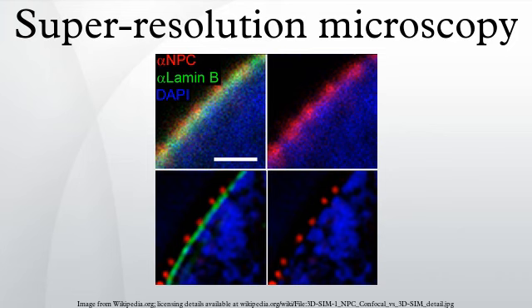SPDM is a localization microscopy that achieves an effective optical resolution several times better than the conventional optical resolution, represented by the half-width of the main maximum of the effective point image function. By applying suitable laser optical precision processes, position and distances can be measured with nanometer accuracy between targets with different spectral signatures.